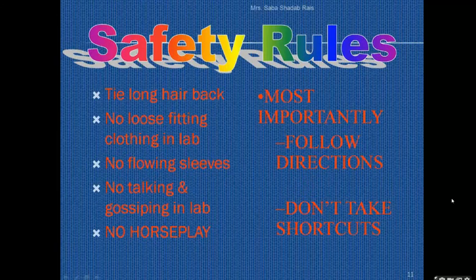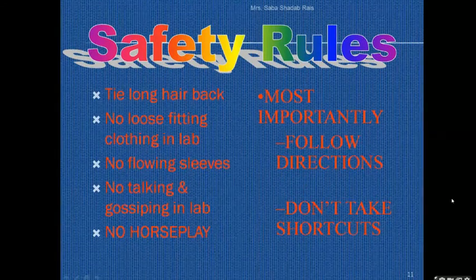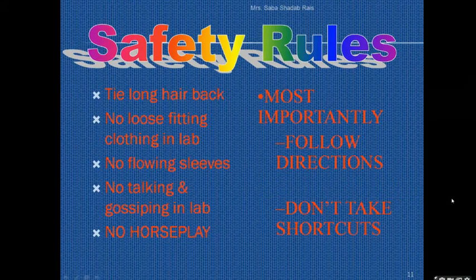Sometimes, now in FY we don't ask students to dilute the acid, but remember this point: whenever you are diluting any acid, make sure first you take water into the beaker and thereafter you pour the acid. You should not go vice versa. Pour a small quantity of the acid and mix it with the glass rod.